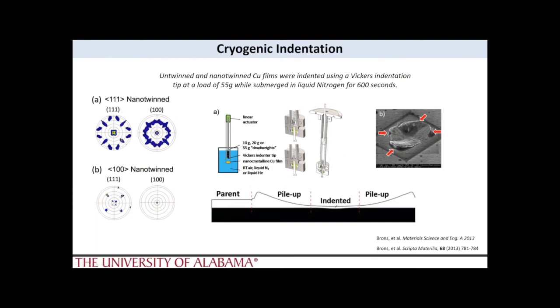After indentation, we removed the sample and performed a FIB lift-out of a TEM foil from the indent region. This is captured here in these papers for those more interested in some of those details. Now, of course, there are some questions: the sample heated up when you indented it, so did the growth occur at those temperatures? Those are actually problems I'm solving today with another collaborator of mine, Eric Homer, trying to do these experiments in in situ conditions.